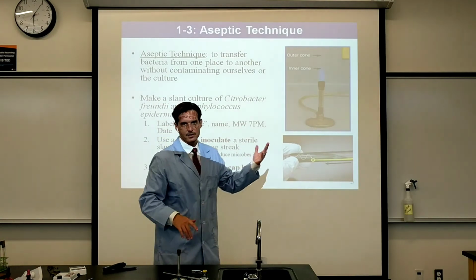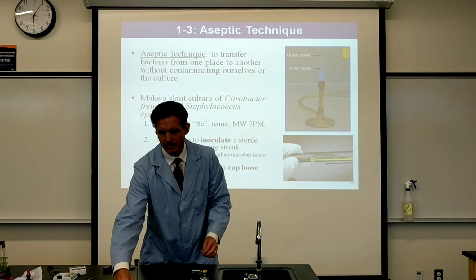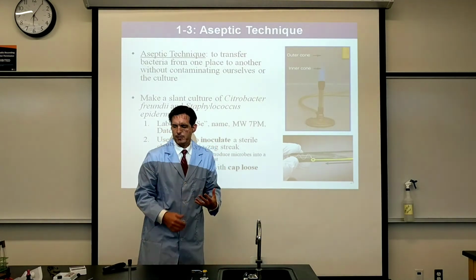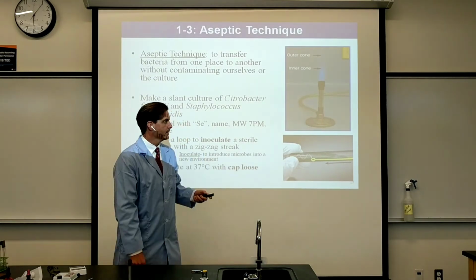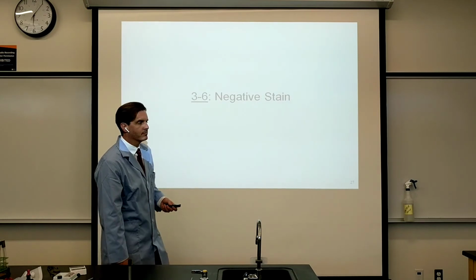For now, that's aseptic technique, you guys, and we're going to learn a lot more about aseptic technique and how to use it on plates and other microbiological equipment, where we see what the do's and don'ts are to make sure we're always free of contamination. And so there's that. Okay, good enough.